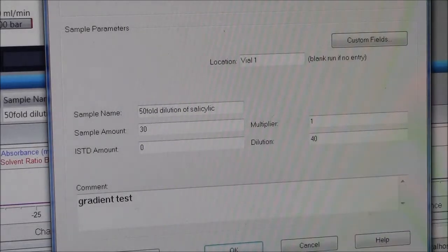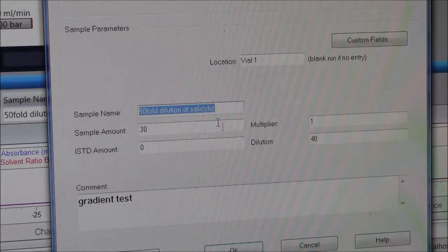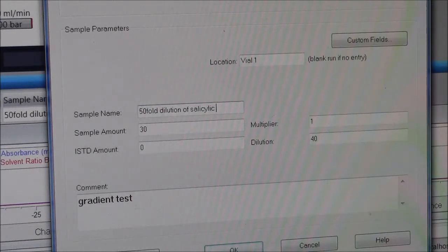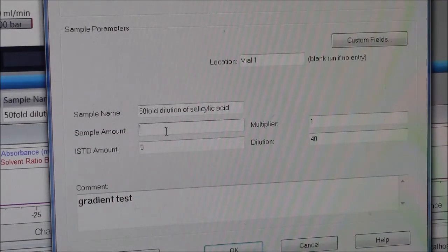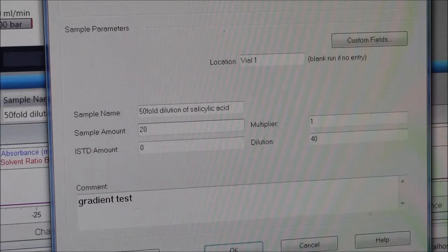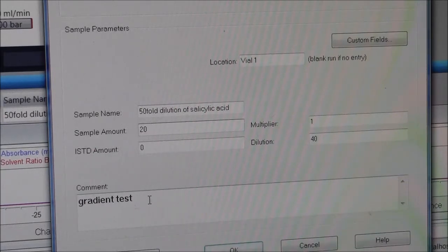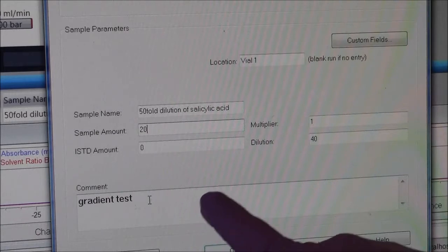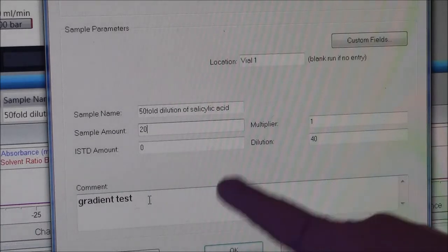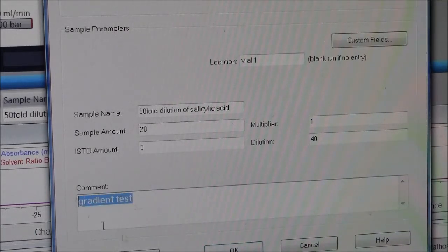A little lower on the page, I have a chance to name the sample. So this is actually where I can be more detailed. 50-fold dilution of salicylic acid is okay. Sample amount, the loop is 20 microliters, so I can put a 20 there. It's not really important, but this comment section is important. This is what will show up on your HPLC printout, so you want to make this fairly detailed.